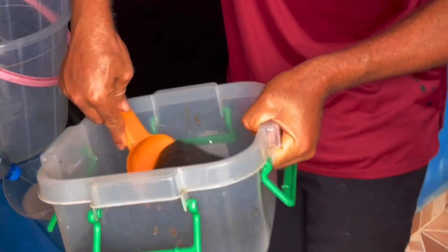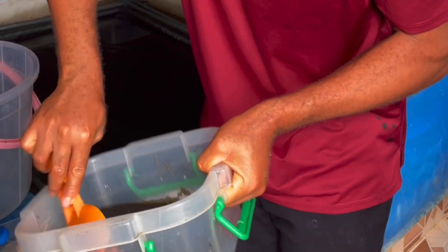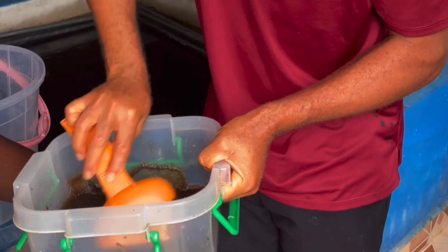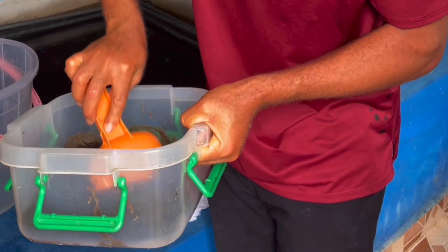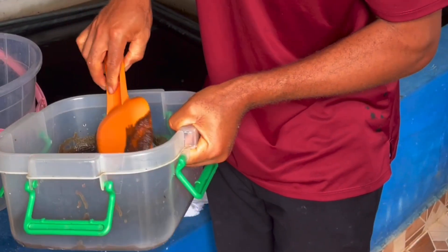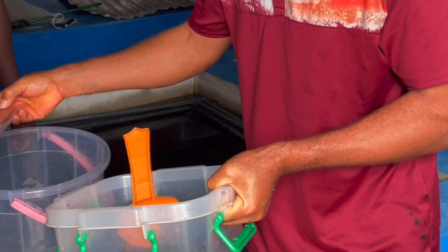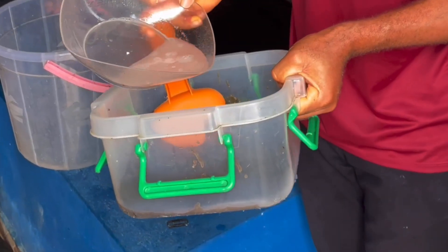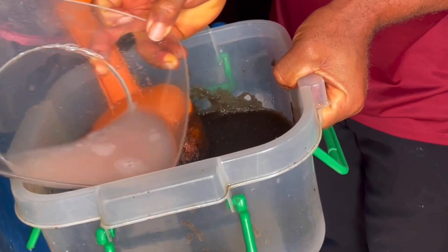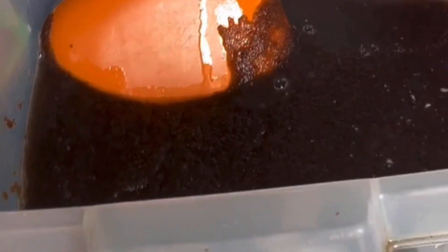These are the eggs. Now we have to stir and do proper mixing. Please when you are doing this, ensure you don't squash the eggs — you have to be very careful. We've also added the milt, or milt sac. Now we stir carefully.